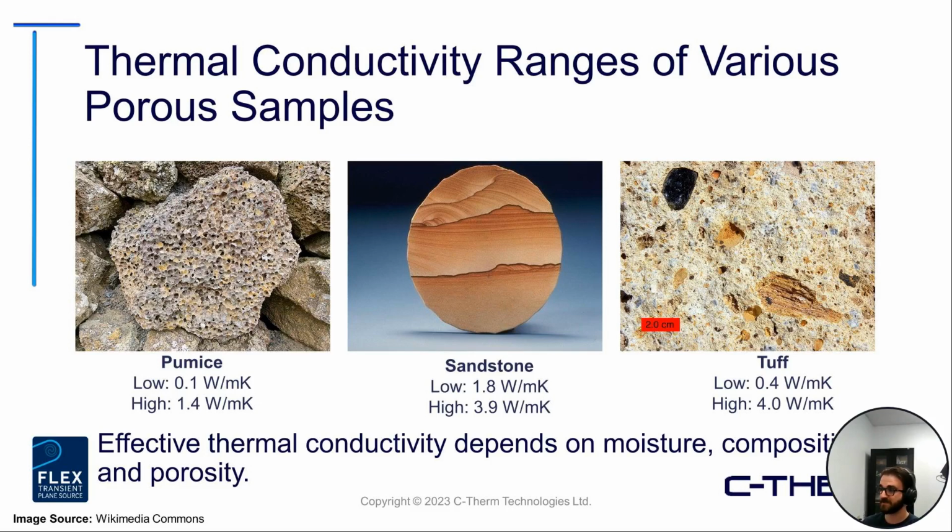And of course, this lends itself well to a range of other sample types. Really anything that is porous in nature, generally the TPS would be the recommended option. But of course, the effective thermal conductivity really depends on the moisture, the composition, and porosity.